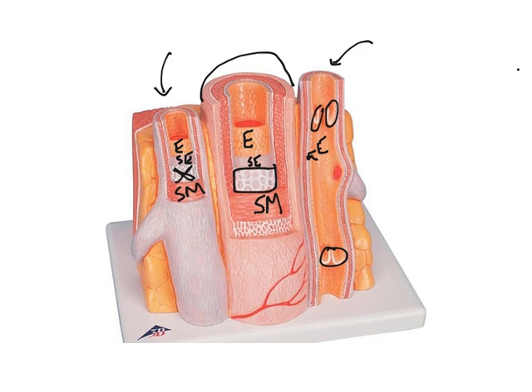Some vessels will have a lot of elastin fibers. The arteries will have this here, that is the external elastic membrane. So in an artery, the tunica media is these two together. In the vein, right now you're seeing just the smooth muscle there.